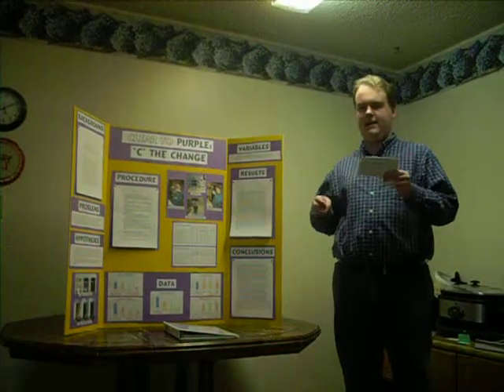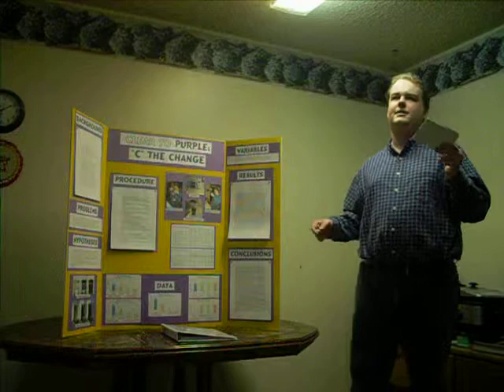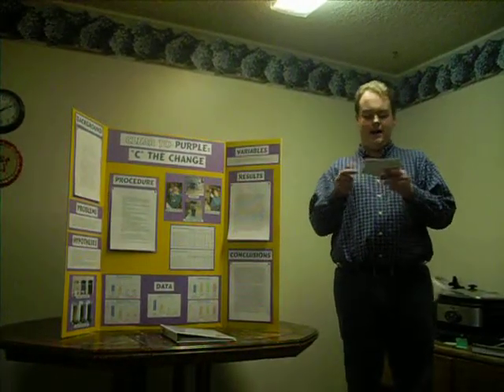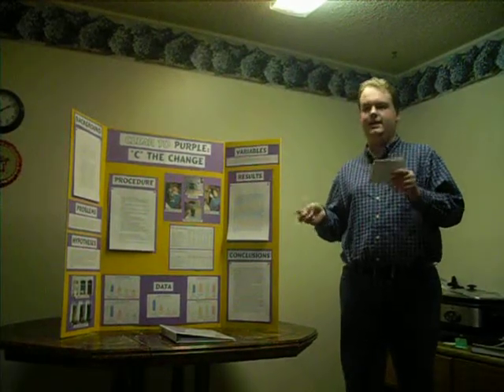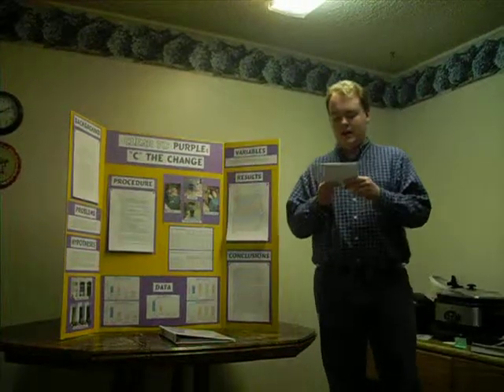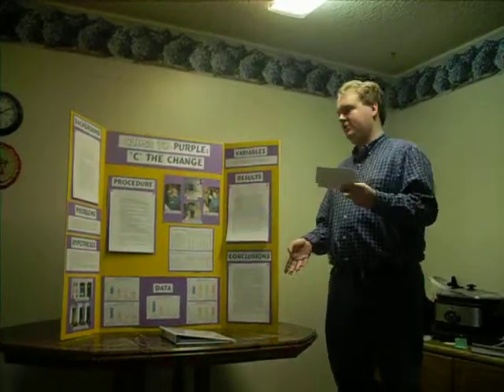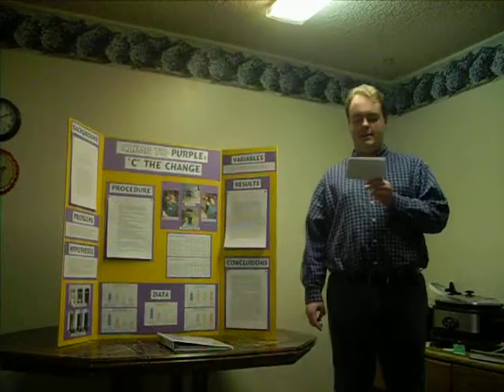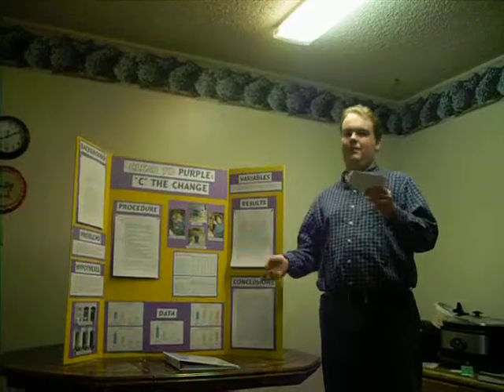I poured B into A and started the stopwatch. Like last time, I swished it twice every 30 seconds for 3 minutes. Meanwhile, I counted the dark blue oscillations that occurred in that time period, then recorded that as my data and averaged it up. My other groups, likewise, were the 0, 50, and 100 degrees Celsius groups, then the 0, 20, and 30 milliliter hydrogen peroxide groups. A lot like before, I chose them based on their ratios.